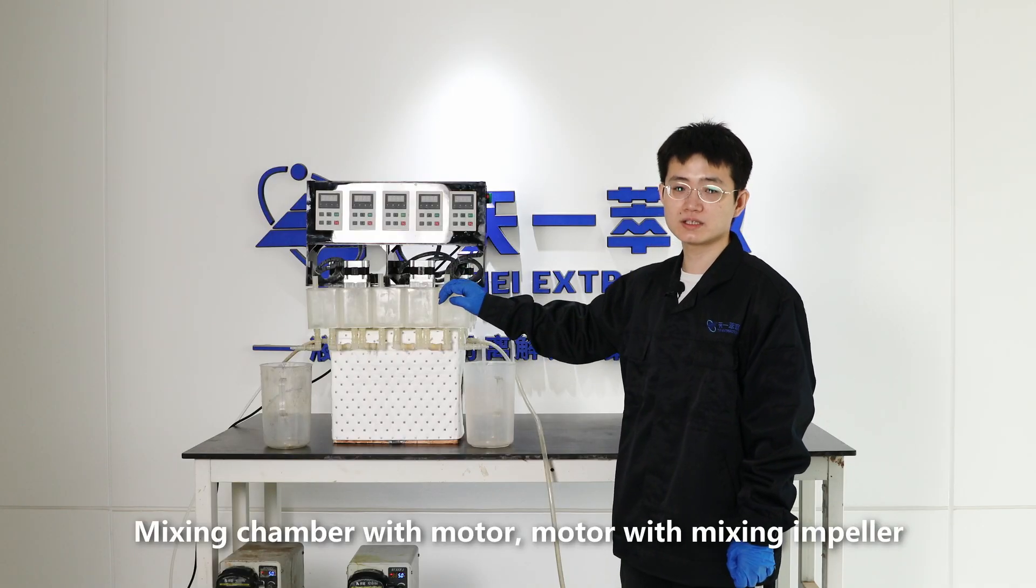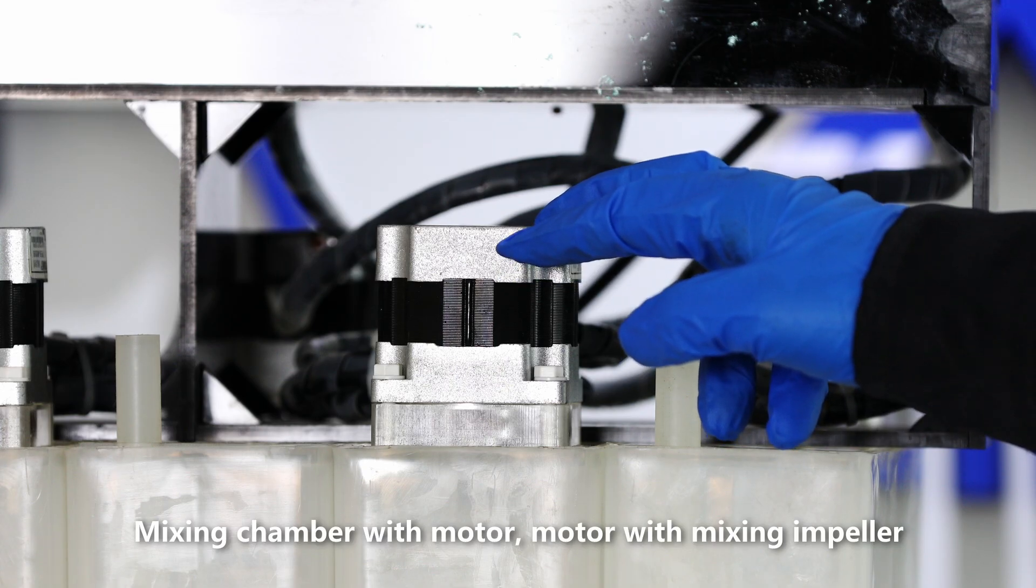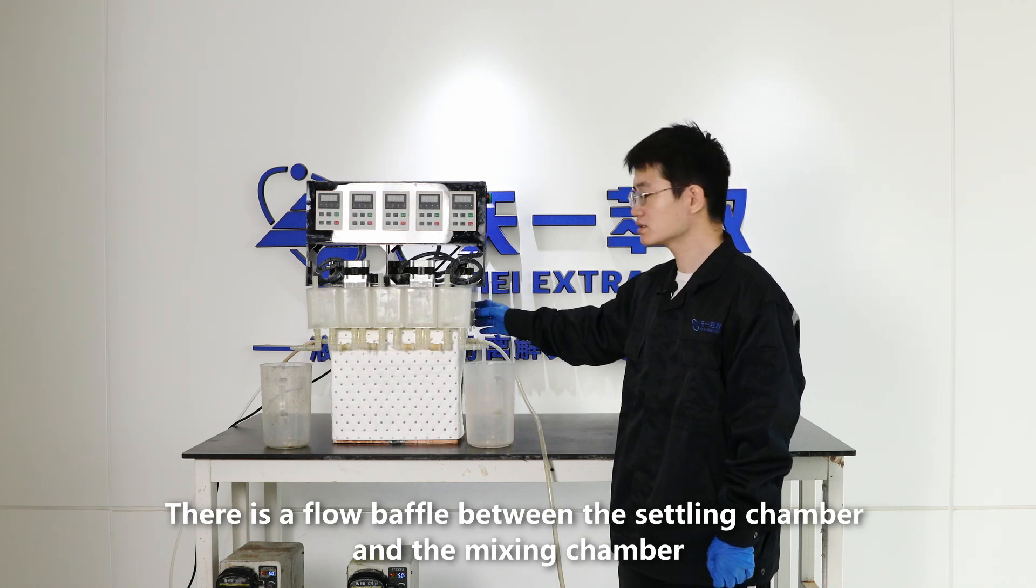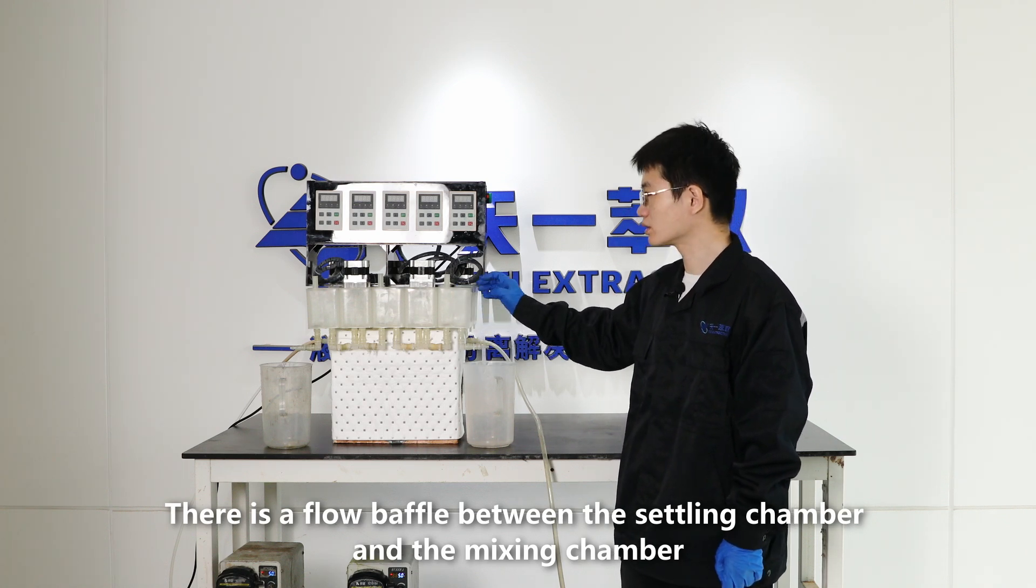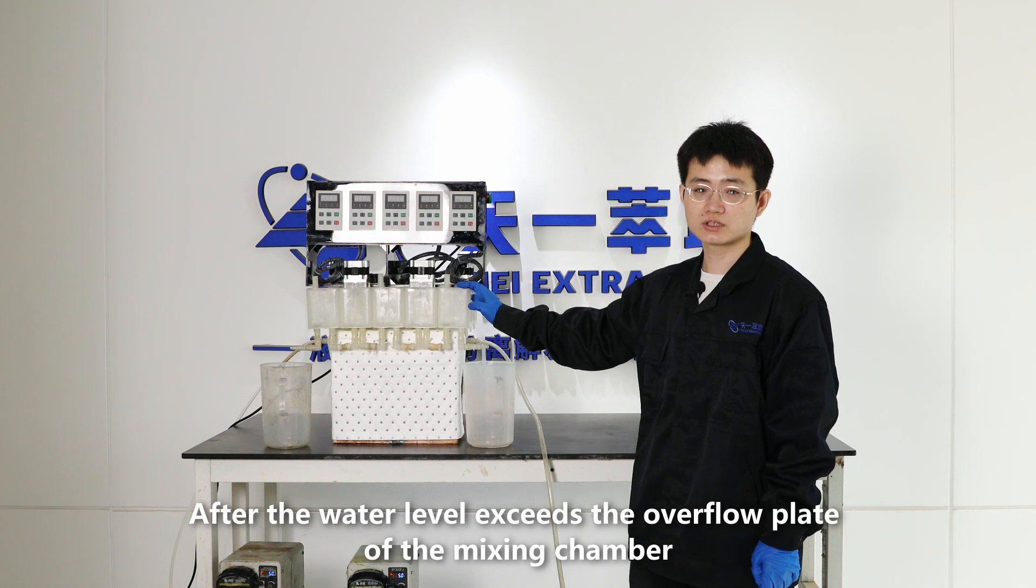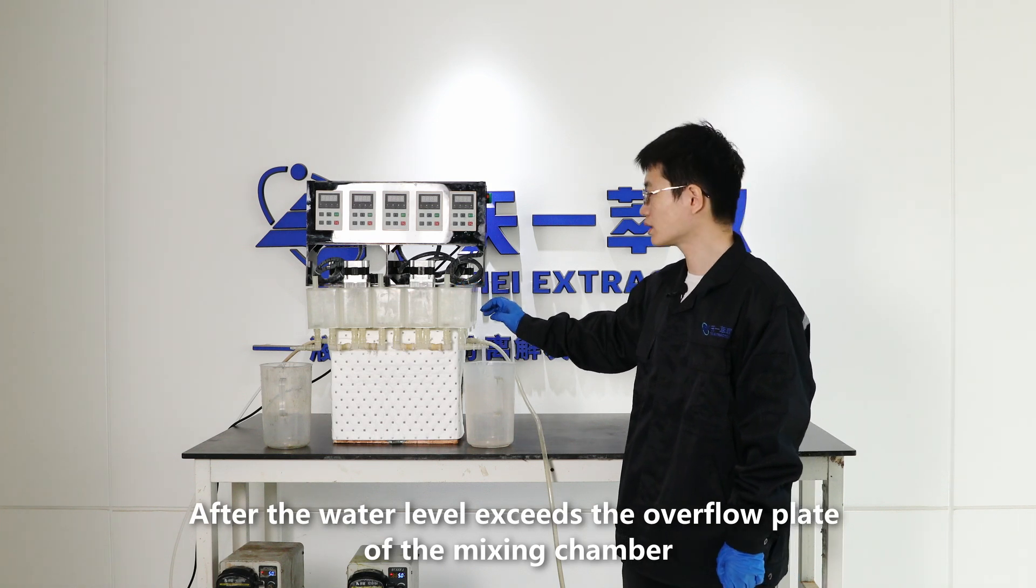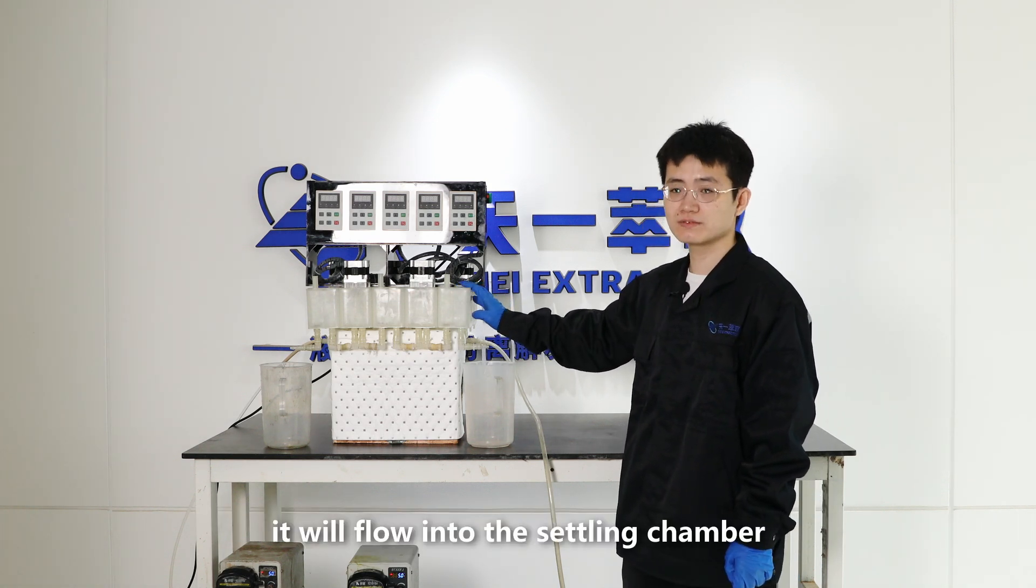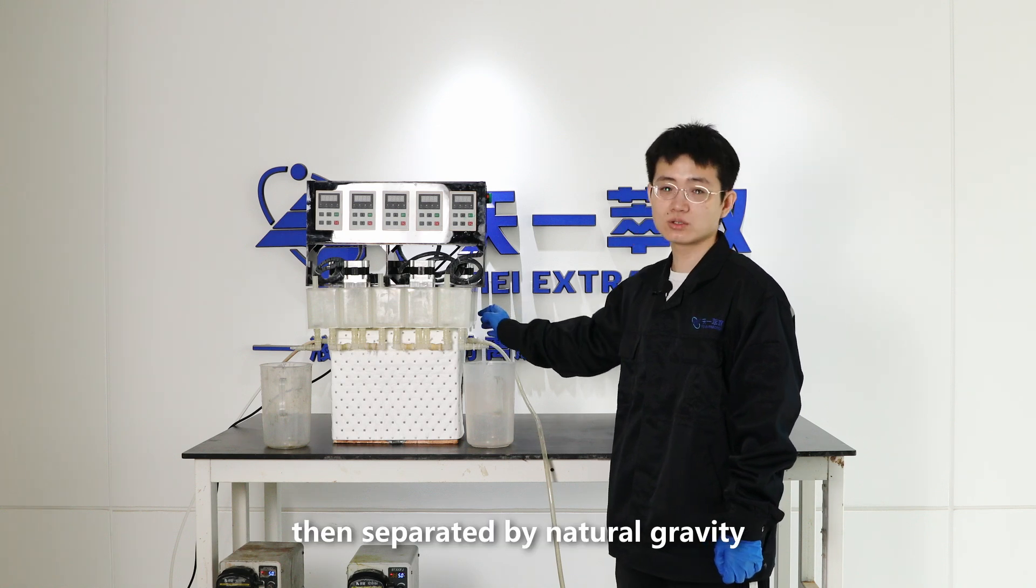The mixing chamber has a motor with mixing impeller. There is a flow baffle between the settling chamber and the mixing chamber. After the water level exceeds the overflow plate of the mixing chamber, it will flow into the settling chamber, then separated by natural gravity.